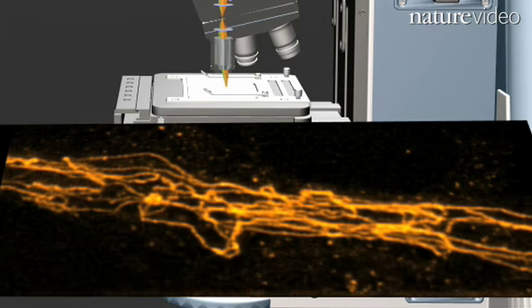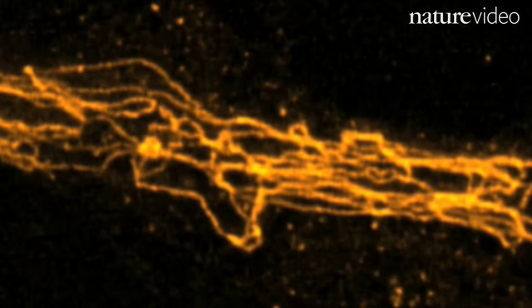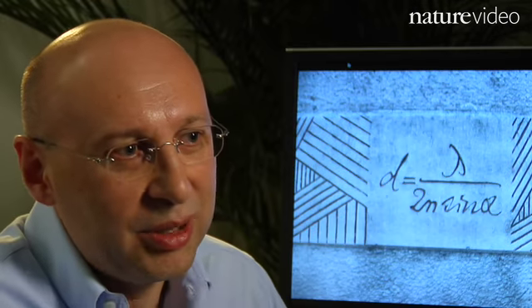And if you have a much smaller spot of fluorescence, you can use that to take sharper images. You just scan that spot across the specimen, and in the end you will see more details, because the sharper the spot, the more details you get.